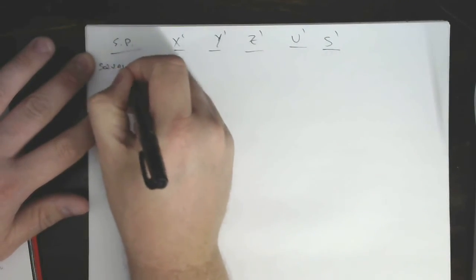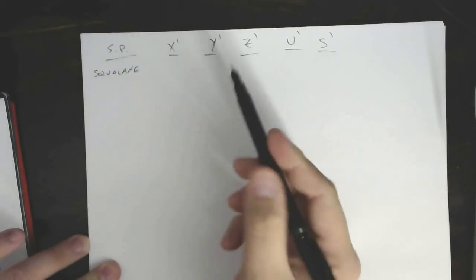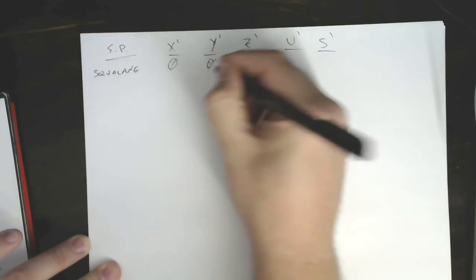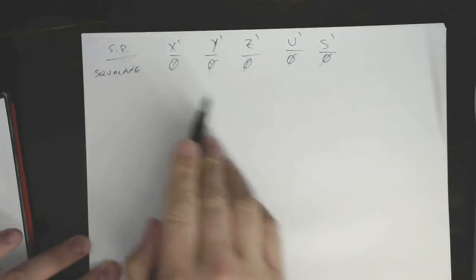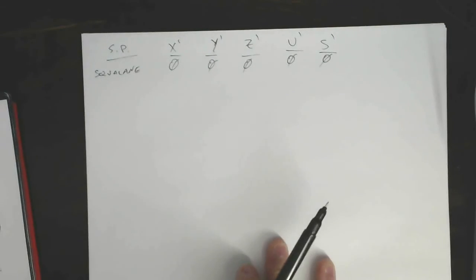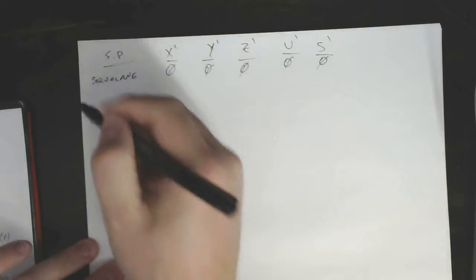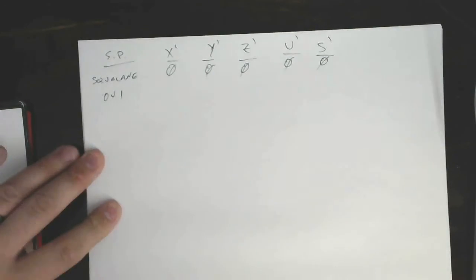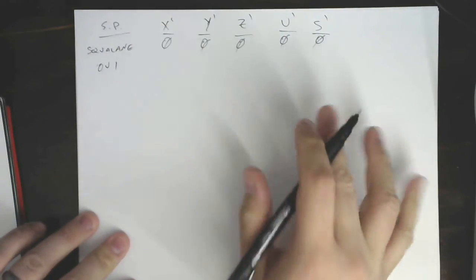Well, by definition, because we're subtracting x of squalane, these are all going to come up as 0, right? This is essentially our prototypical non-polar stationary phase. It essentially models none of these, or at least by this mathematics, it models none of these interactions that we're interested in. If we look at something like OV1, really common, that's just PDMS inside a capillary tube.